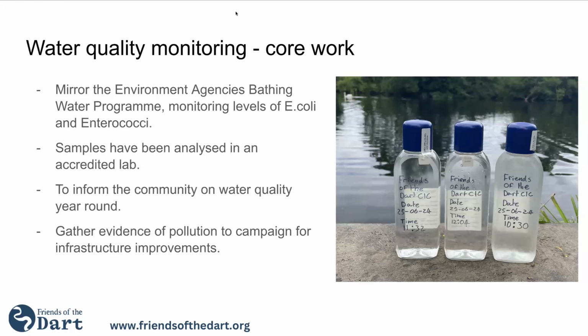So I'm going to talk to you a little bit about the water testing and the work that we've been up to. Our main water testing has been focusing on bathing water testing. What that means is we've mirrored the Environment Agency's approach to monitoring bathing waters, and this is the same as happens in the EU as well. So we've been taking samples, and these have been analysed for levels of E. coli and enterococci.